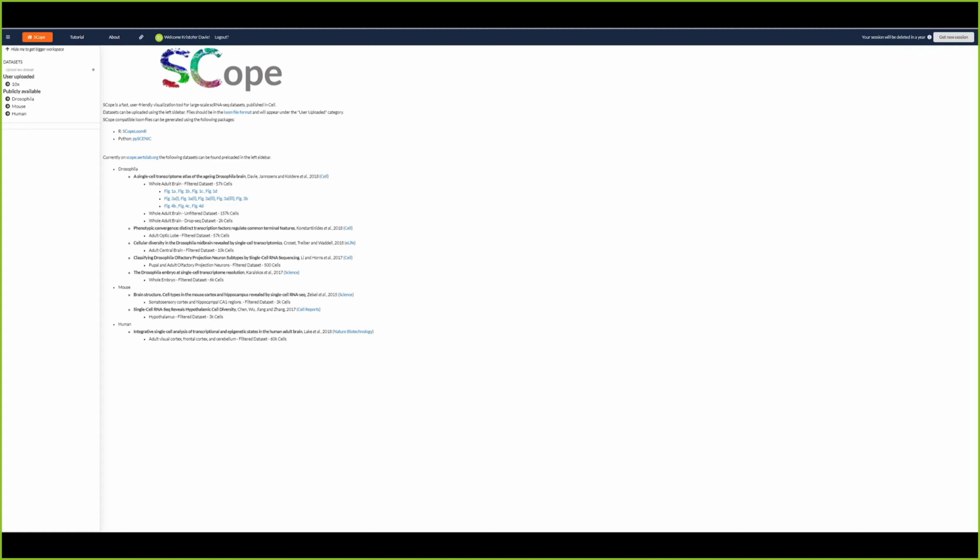What you'll notice is that you've got a couple of cells here that are highlighting in different colors, in purple and in yellow. And this is much like in immunohistochemistry. You're going to get the combination of the three primary colors here to be able to see where multiple genes are expressed in the same cell.